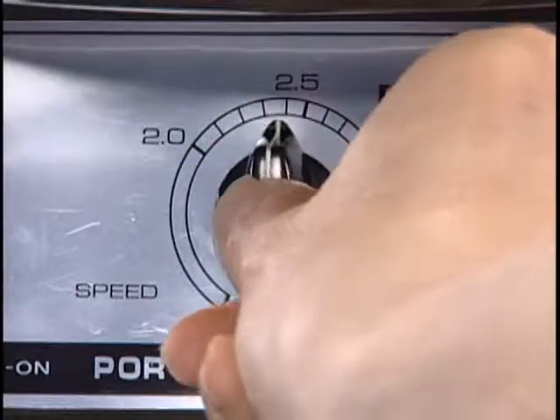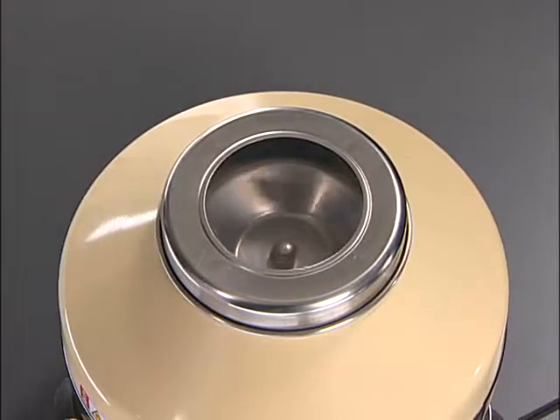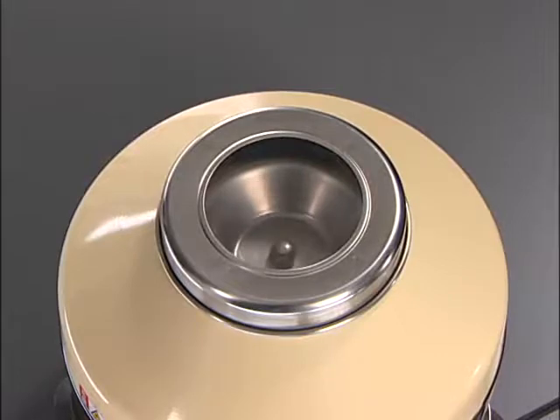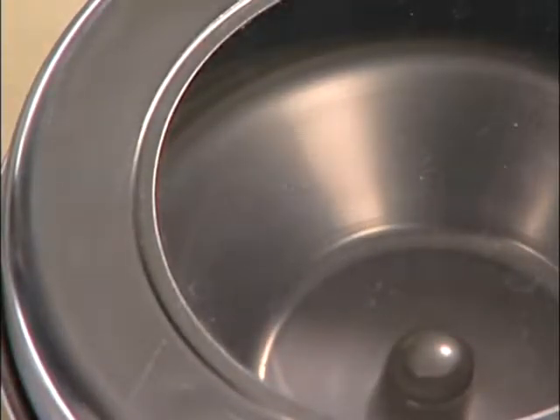Start centrifugation by slowly turning the speed dial to a preset value. The high speed of spinning results in a centrifugal force causing the precipitate to separate.